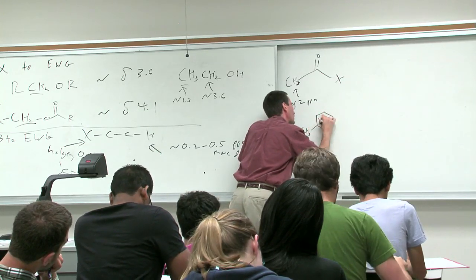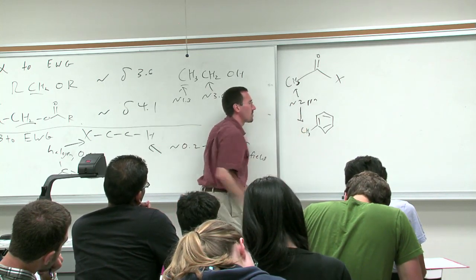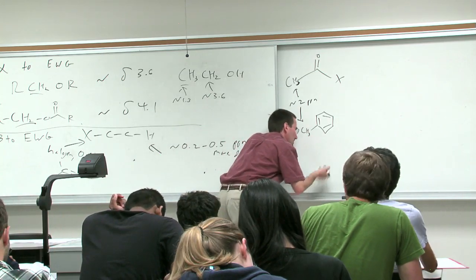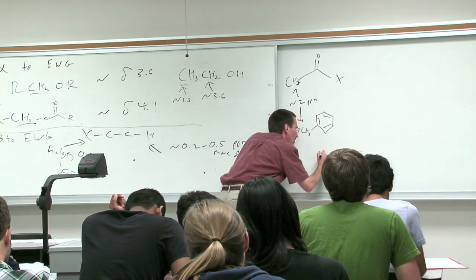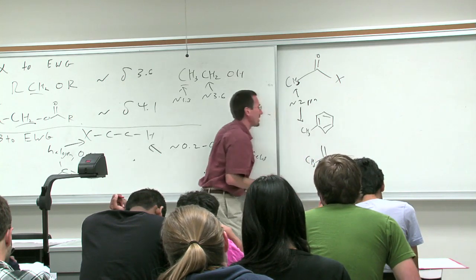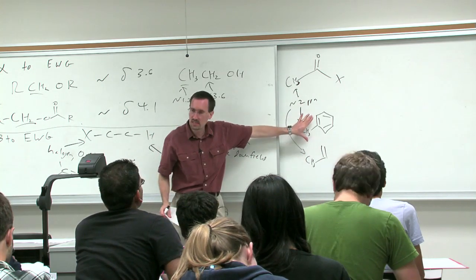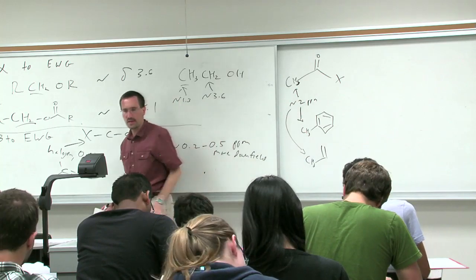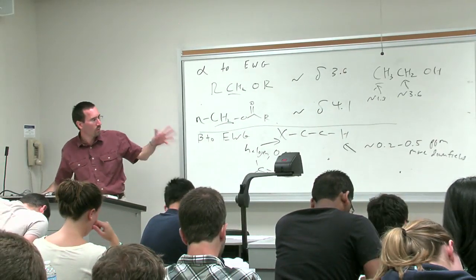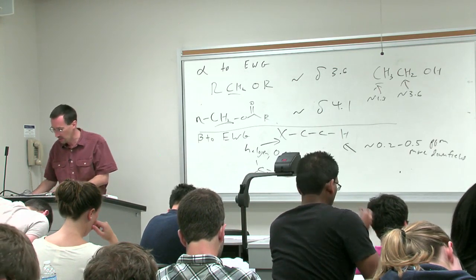But you can also talk about a methyl group on a benzene as about 2 ppm, and also any sort of benzylic off of a heterocycle. It'll be a little bit of a cheat because it's really closer to 1.7. But if you fit all 3 of these into your head as 2 parts per million, you'll have that baseline knowledge. If you prefer 1.7, if you've got a good memory for an allylic methyl, take 1.7.